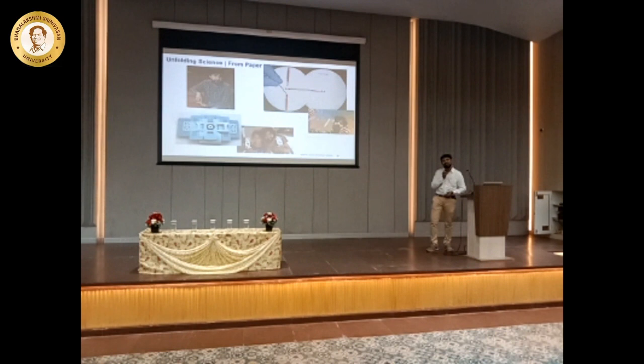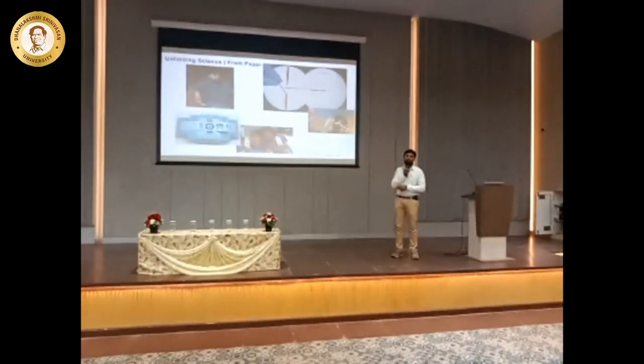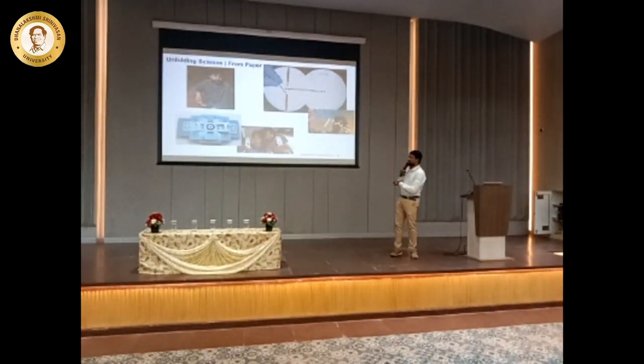And this guy, Manu Prakash from Stanford, has developed two different things, which are very simple. One is the Foldscope, and the second one is something we used to play with in childhood. This guy has patented this. Do you really believe it? He has patented this game. You find it as a game, but he finds it as science. He's unfolding the science. What he did with this is separate the blood plasma. That's amazing, right? You do it for 2 minutes, and the blood plasma gets separated.